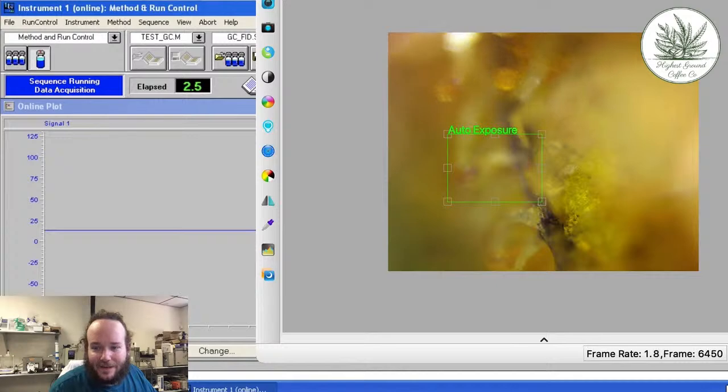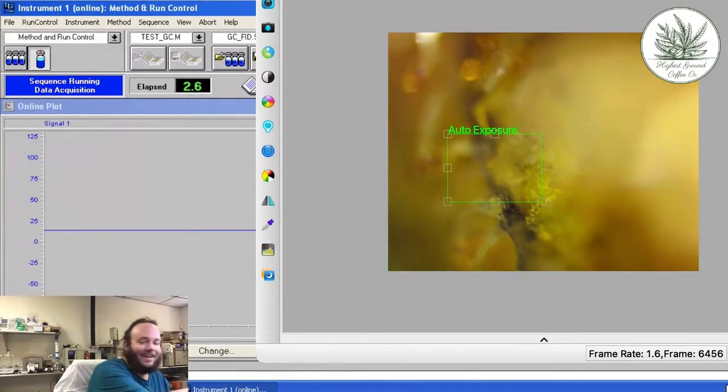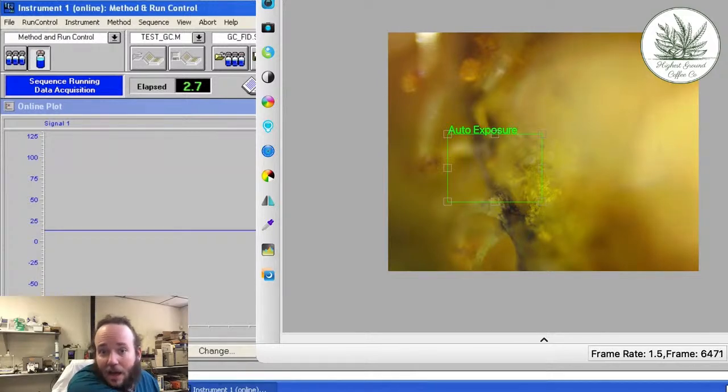Hey, David. Yeah, it's very accurate. It's a microscope for the lab, of course, so it'll go up to 100 times resolution, which is way more than you need. The downside, though, is getting some of these details is really challenging.